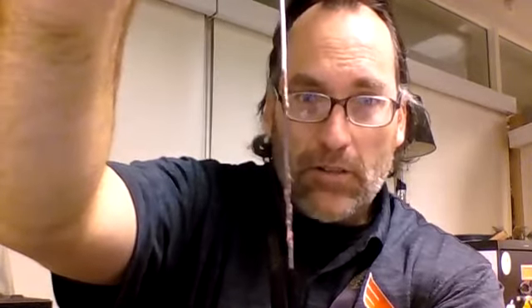All right, our last measurement at approximately 5 minutes is going to be taking the paper clip out so we can see it a little bit more clearly. So I'm going to go ahead and do that. I'm going to try to do it slowly here so I don't mess anything up. All right, so here is the paper clip now at the 5 minute mark. And again, you can see the very distinct line where the paper clip was touching the copper sulfate, and the fuzziness on your paper clip, what is now on there that wasn't there before. So again, I've already talked about what kind of changes those are.